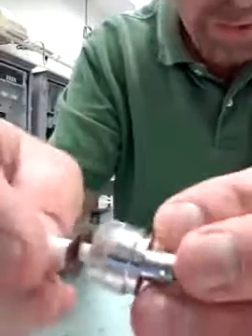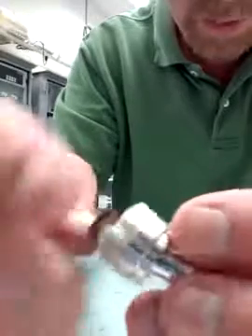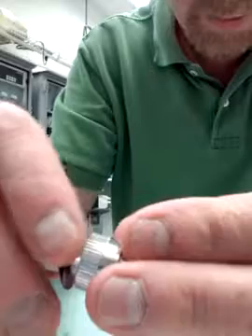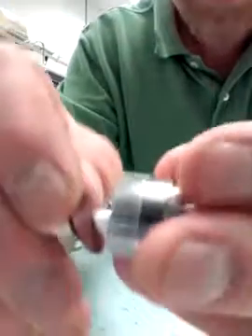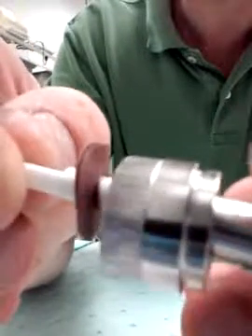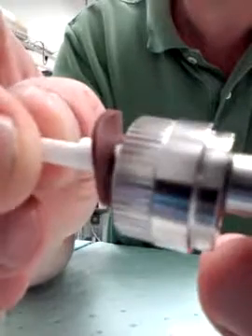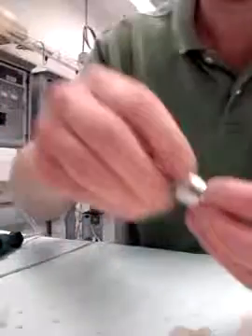What you don't want to do is just jam these seals onto the shaft, because what will happen is the inner diameter will sort of get shoved underneath. You can see how that inner diameter lip is uneven.